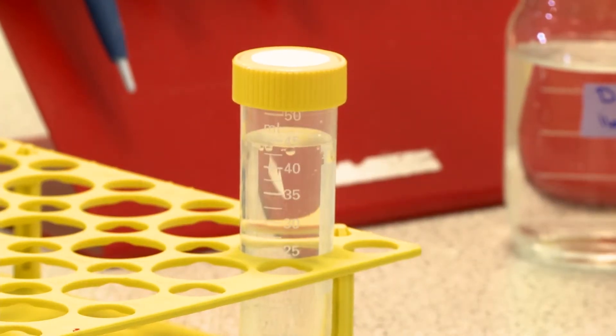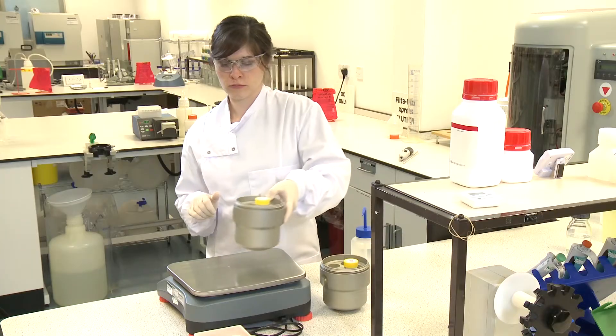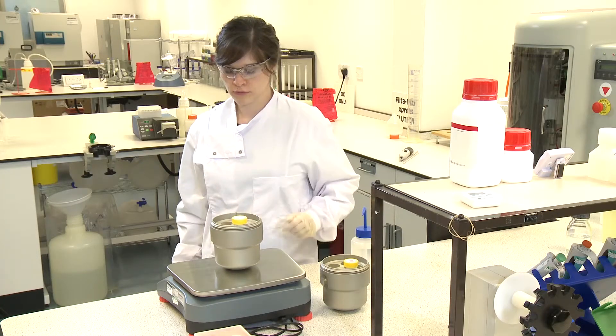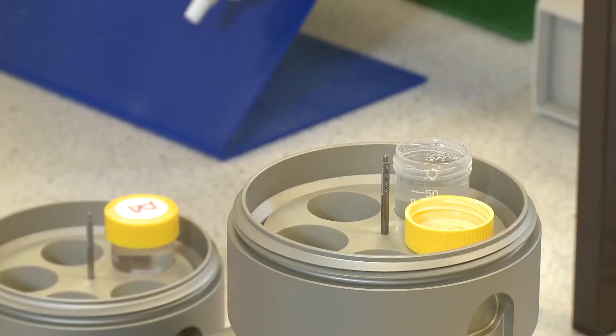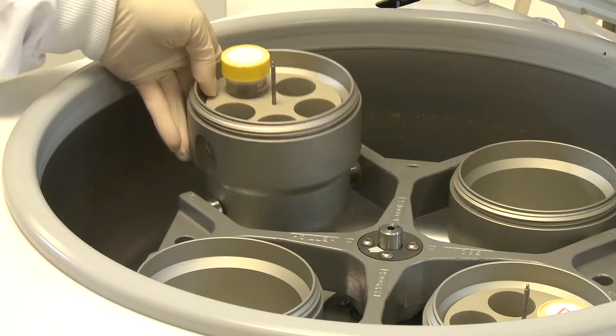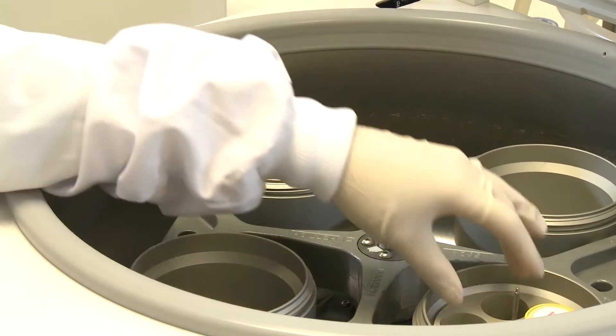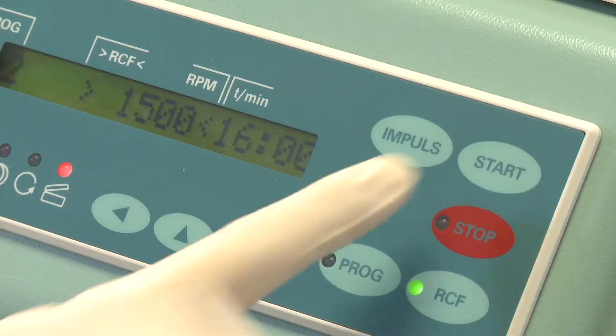Perform the second centrifugation step. Ensure that the inserts and supports for the 50 milliliter centrifuge tubes are balanced to within 0.5 grams of each other, then place into the centrifuge. Set the RCF to 1500 times G for 15 minutes excluding ramp-up time. Set acceleration to maximum and deceleration to minimum with the least amount of braking.